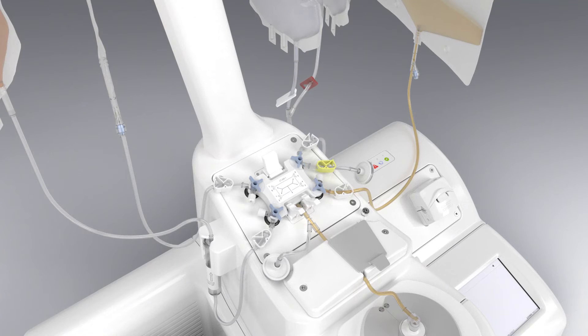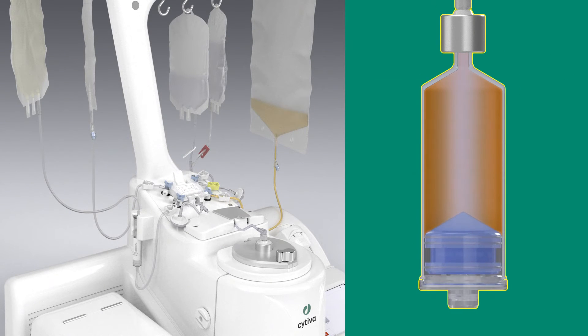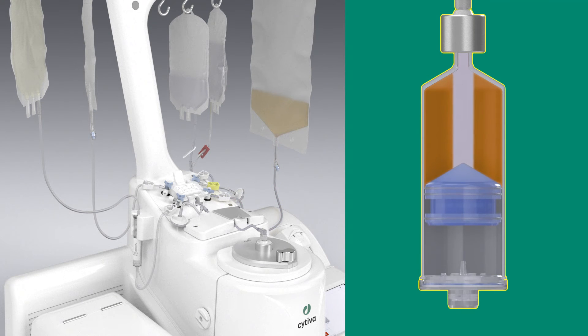Then, washing cycles are performed. Configure washing steps to optimize washout efficiency and cell recovery.